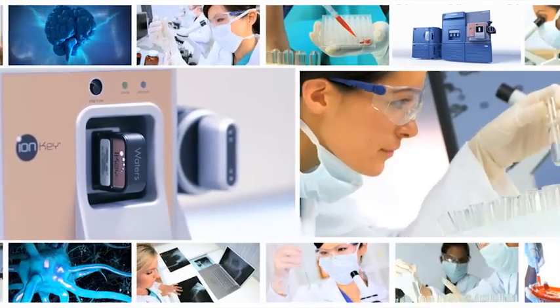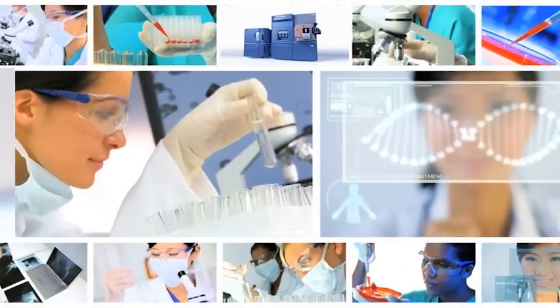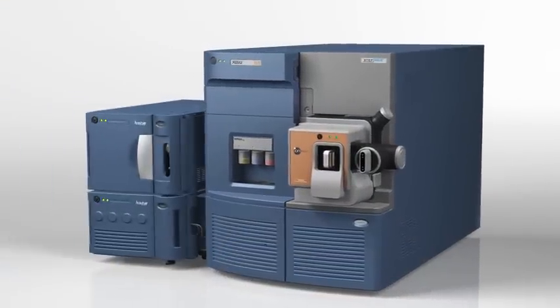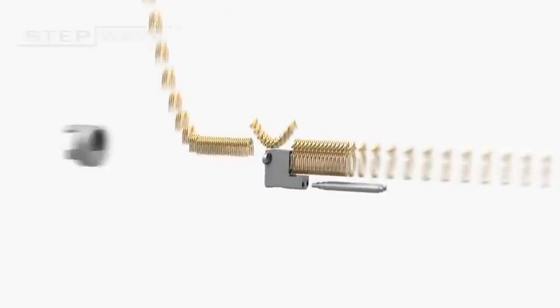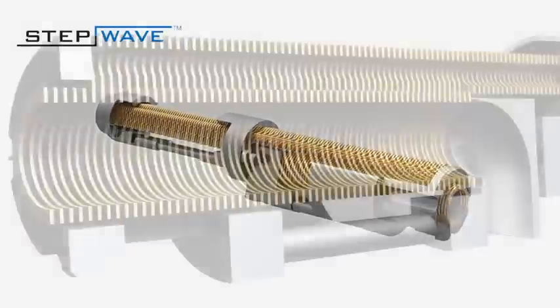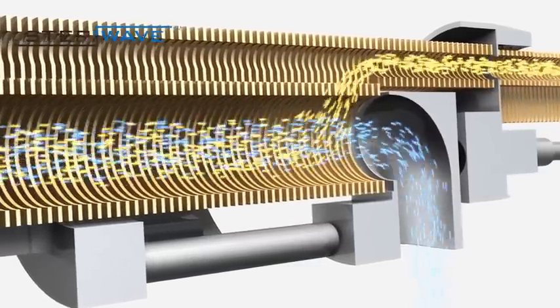Tried and tested by some of the world's most demanding laboratories, the IonKey MS system, coupled with the Acuity UPLC M-Class and Waters mass spectrometers with StepWave technology, delivers unprecedented levels of performance, robustness and reproducibility.